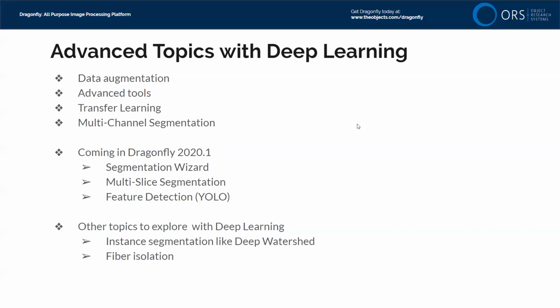In fact, I didn't even say this, but I think in all or in nearly all cases, the success of the network actually improves if you do a multi-slice training instead of a single slice training. So that raises the question, when would you ever not do multi-slice training? Well, if you don't have good 3D context, so if your slices are not closely spaced in 3D, you might not gain any benefit. And it does slow down the training and the inference. It requires more memory in the graphics card as well. But in general, I think we're going to see a trend where everyone moves to multi-slice training as a default.